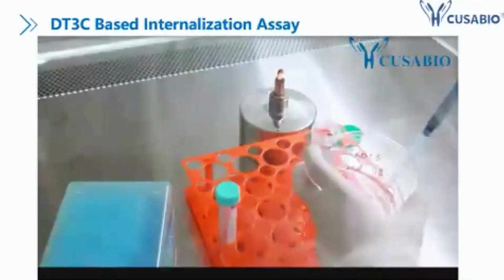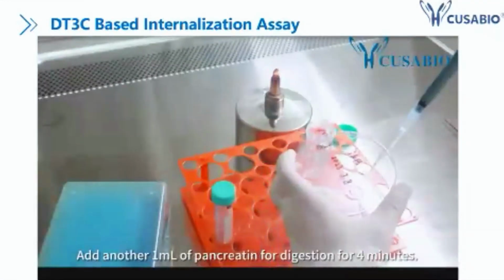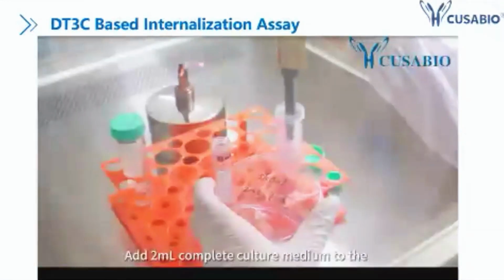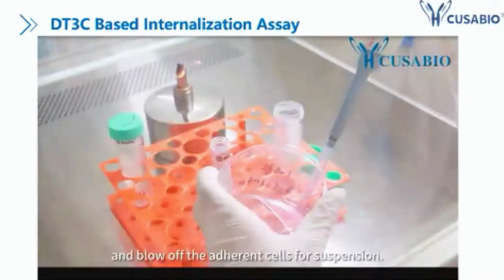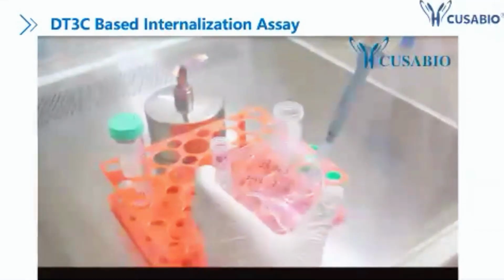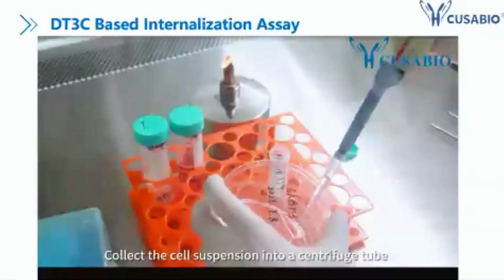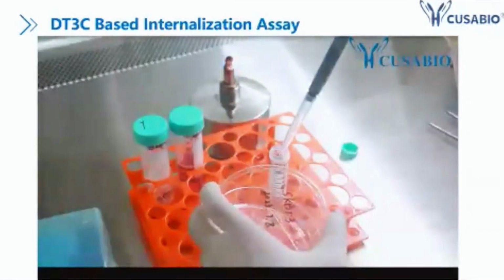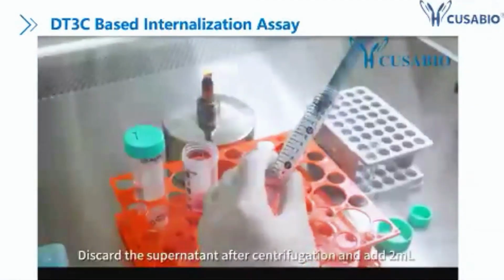Our lab members digest the cells, collect them, and then count them. This cell preparation step may take some time.